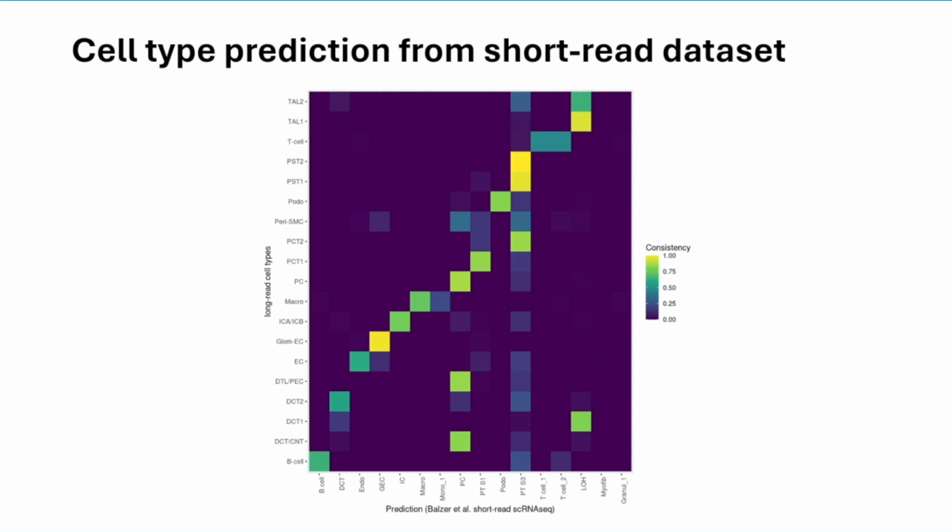And I will say, with the new implementation of Dorado, even that part of the analysis has greatly improved this. I don't have the other data set, but it looks a lot better. So I think everything seems to be improving for this kind of workflow.